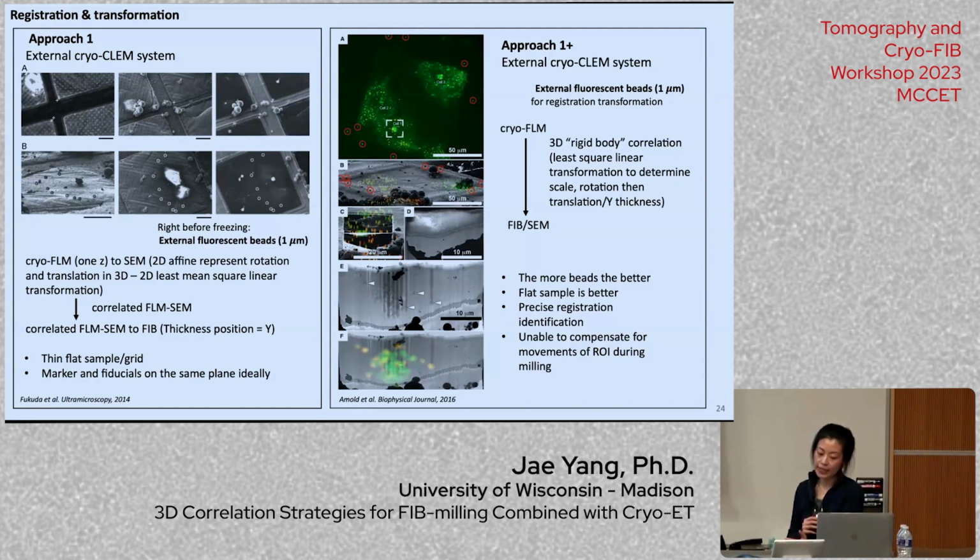And so it is still that more beads are better, flatter samples are better, and precise registration identification is very important. However, both methods are unable to compensate for the movement of the ROI during milling.